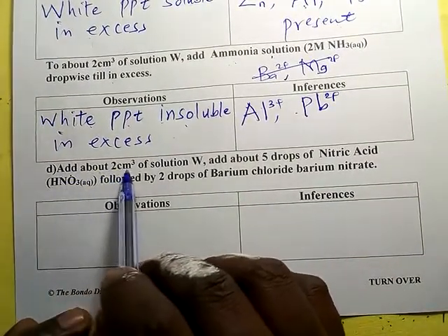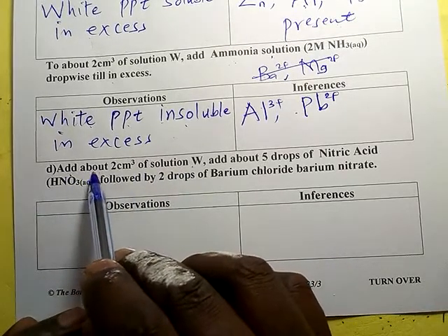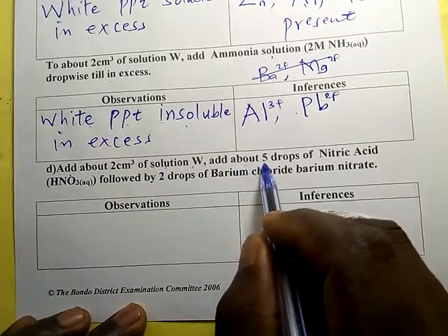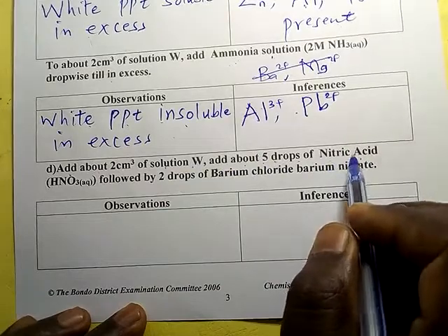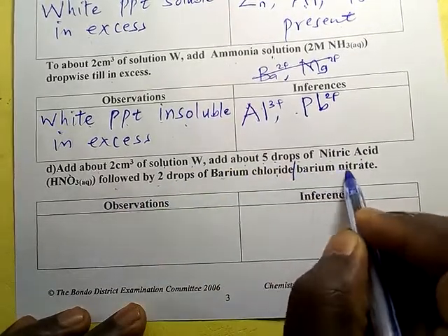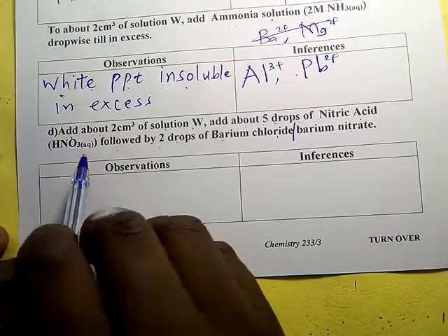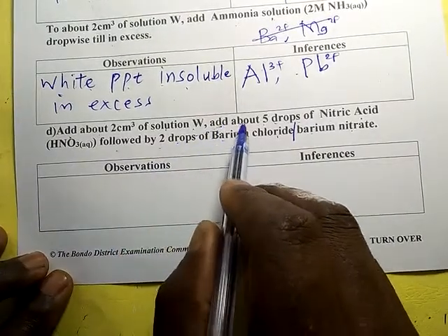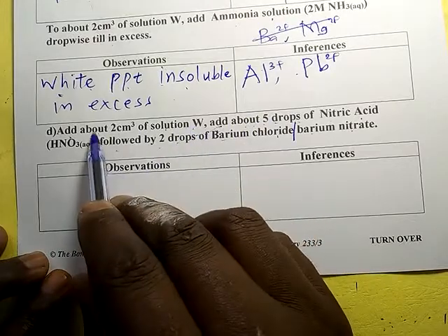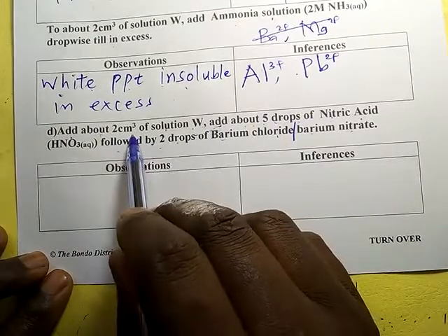Add about 2 centimeters cube of solution W. Add about 5 drops of nitric acid, followed by 2 drops of barium chloride or barium nitrate. So the first thing we expect here is effervescence or no effervescence, because here we are adding acid to a solution.